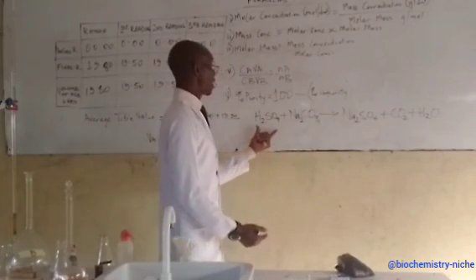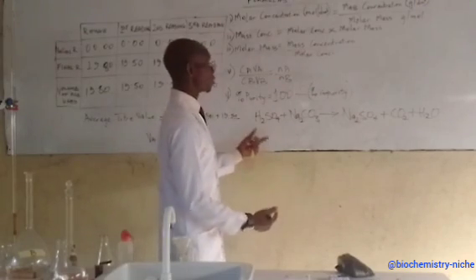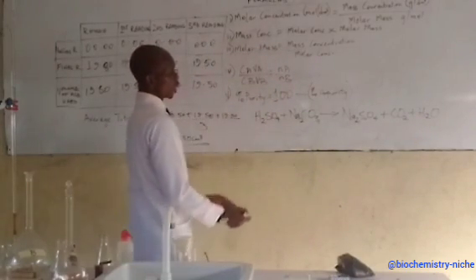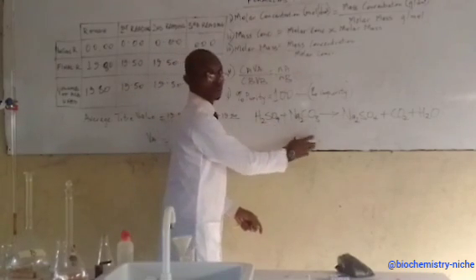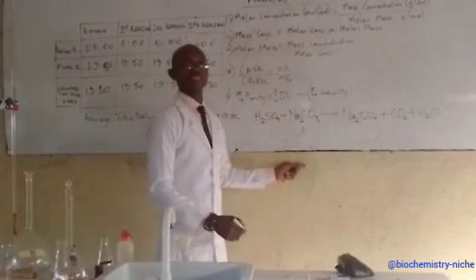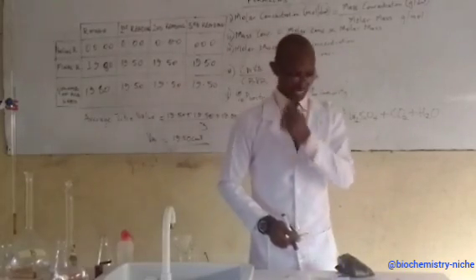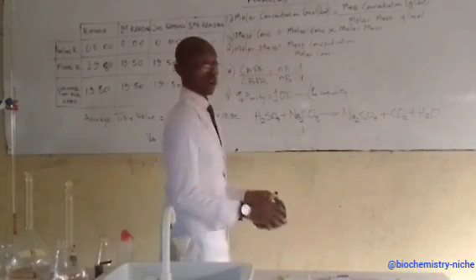We are having our acid being neutralized by the base, or the base neutralized by the acid. Eventually, we are going to be having salt and water. Here we have our salt and water. So this is what we have. If we look at the reaction, I think the reaction is balanced, and it is giving us our acid to our base in ratio 1:1. So since our acid to our base is in ratio 1:1, our NA to NB will be 1:1. I believe that is clear now. Alright, so having taken this down, let us quickly look at a couple of questions.